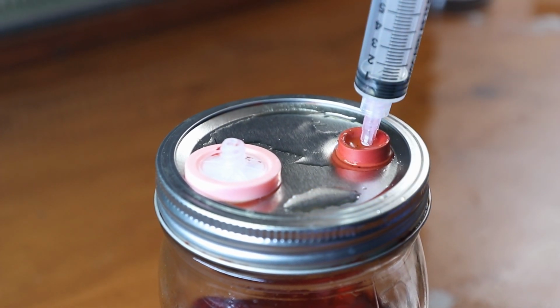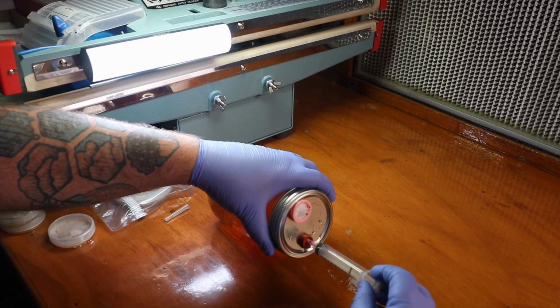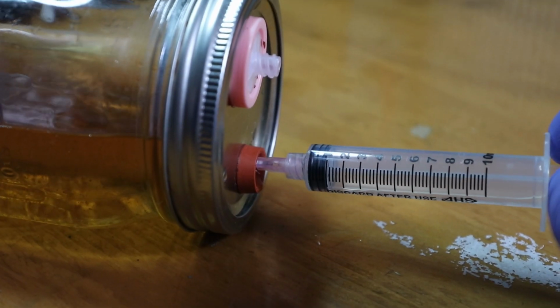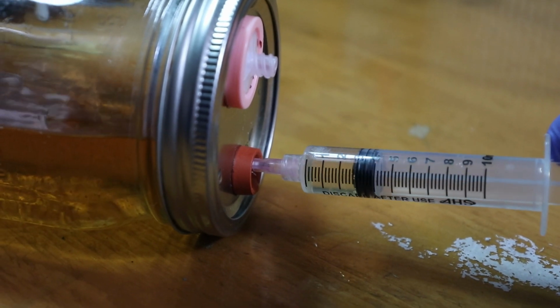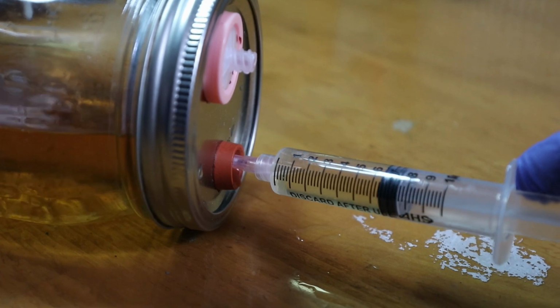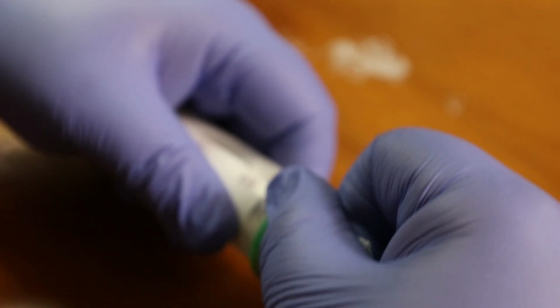You're then going to charge your needle, your syringe. You're going to do this by just sucking up some liquid culture. I like to depress the syringe again to get rid of any air bubbles. But this way you're going to have some liquid culture behind the plug, the biopsy plug.